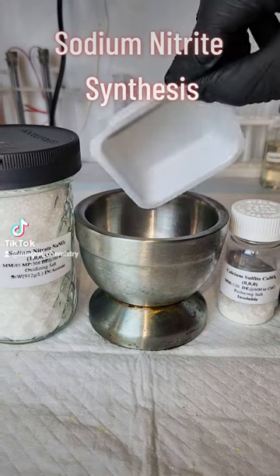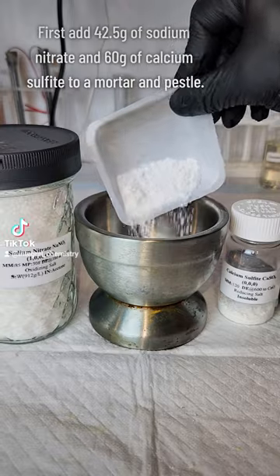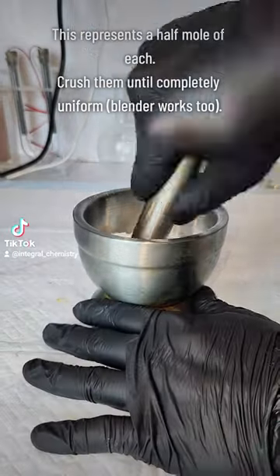Today I'm going to synthesize the incredibly useful chemical sodium nitrite by the reduction of the much more common and readily accessible chemical sodium nitrate.